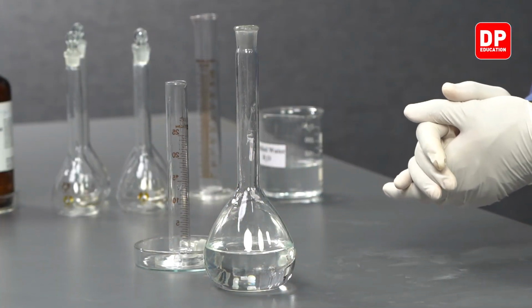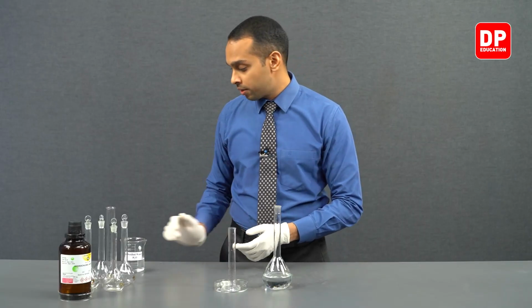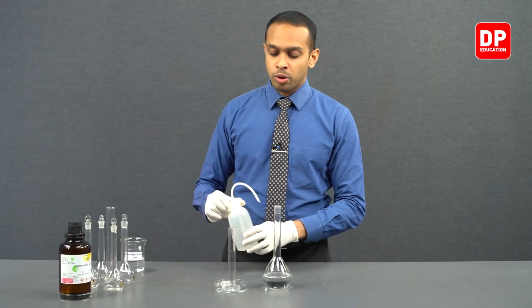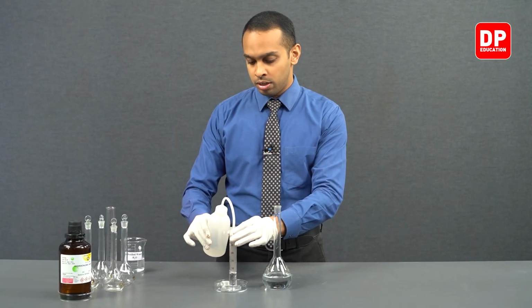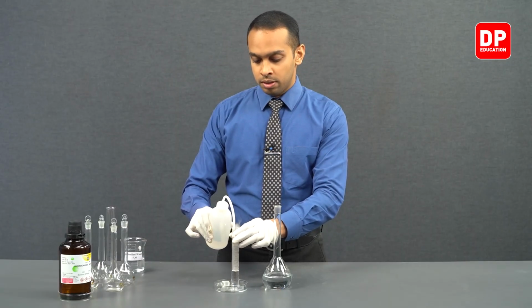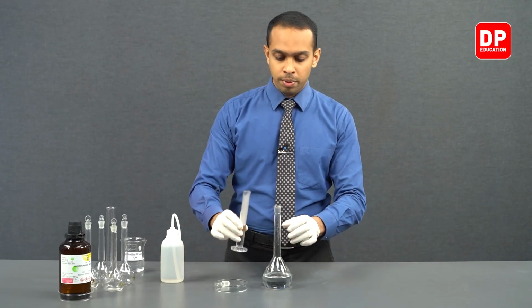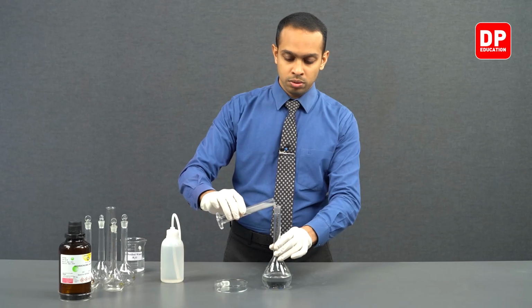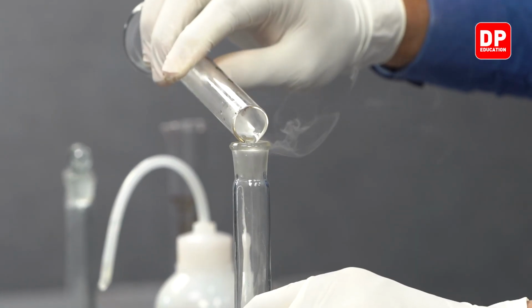And to make sure that we have transferred all of the acid into our volumetric flask, with the help of a wash bottle, we can wash our measuring cylinder also a couple of times, and we can add it to our volumetric flask like so.